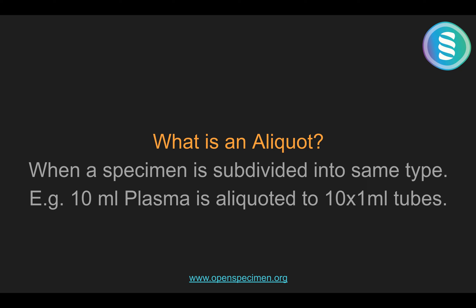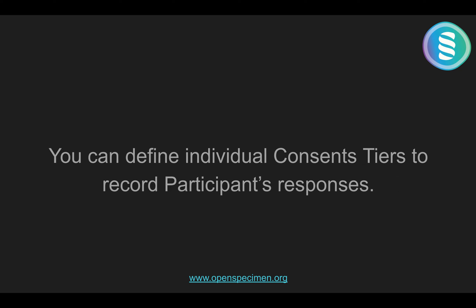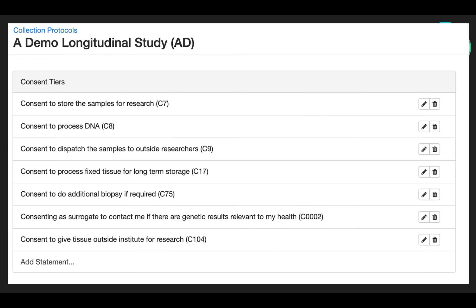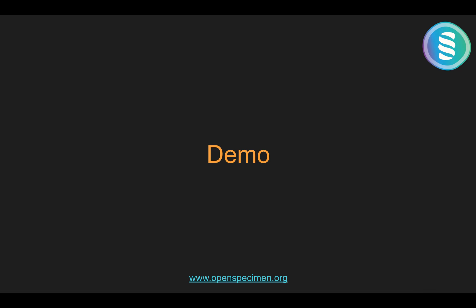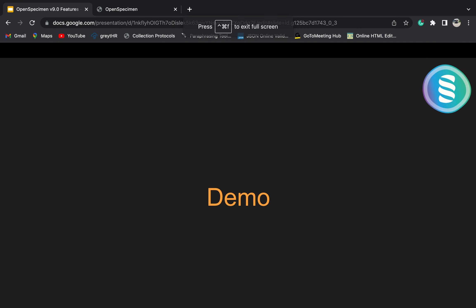In OpenSpecimen, you can define individual consent tiers to record participant responses. You can see here that different consents are configured for the CP. You can also ignore this step if you do not want to record consent in OpenSpecimen. Let me give you the demo.